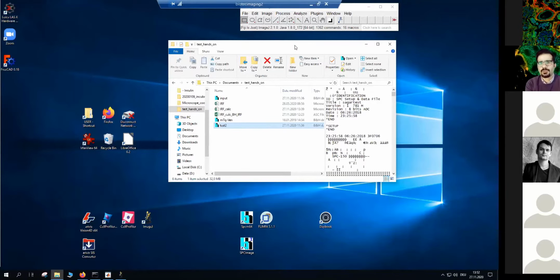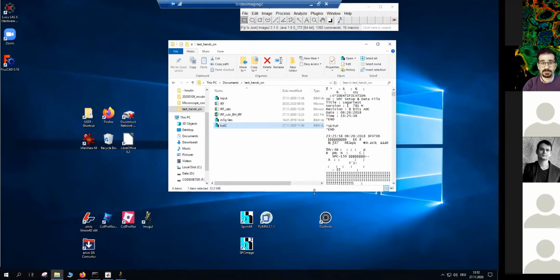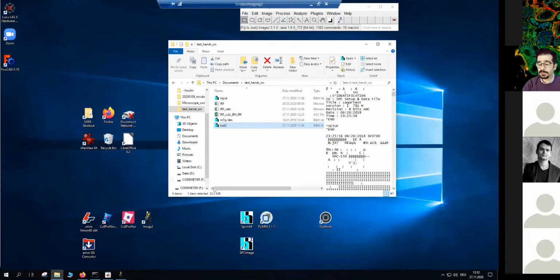So that would be like a project line which is receiving consistent support. So that's the matter of funding, that's the matter of how the groups are handled and so on. So I think that's the reason, and this discussion and this conversation is beyond the context of this workshop. And I would like to just showcase a few, not really going too much into details, that might not be very helpful for everyone. I have to mention that this is a very important discussion. So many people benefit from open source softwares in general, but we need to make sure that it is also maintained over time.